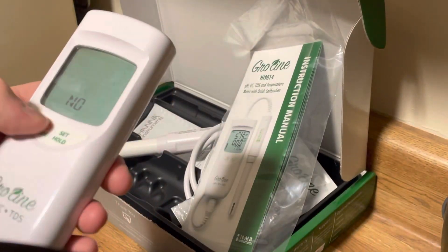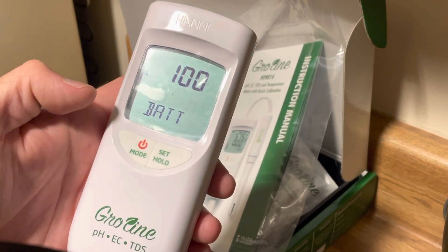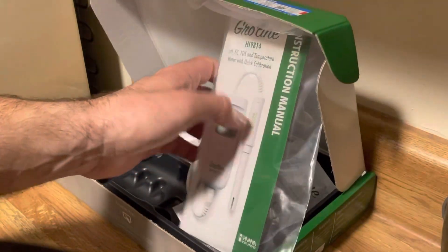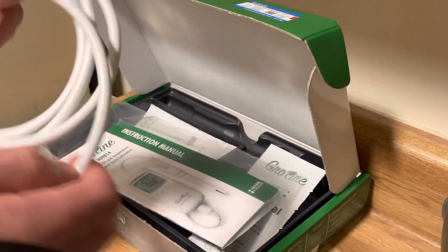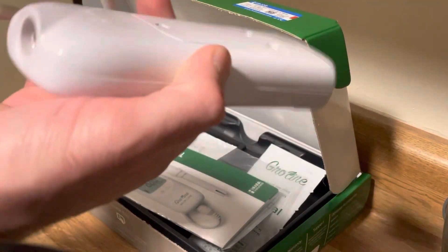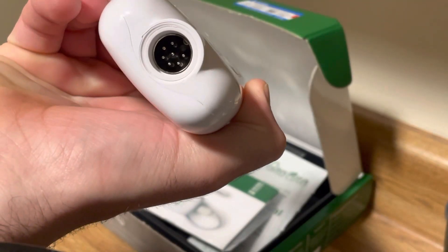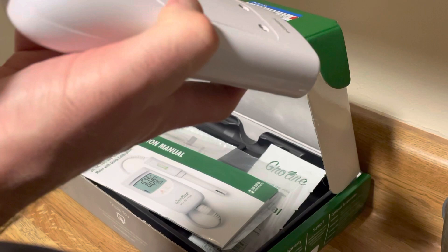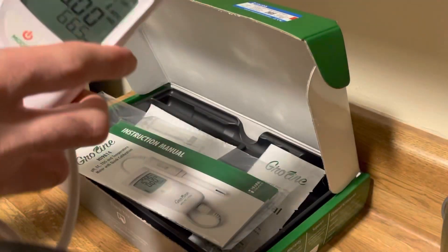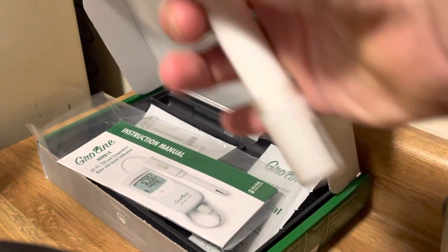Let's turn it on and see what it does — 100% battery. It says 'no probe,' so the probe is that piece right there. You take your probe, unravel it, take this side and it's going to go right into the bottom. Match it up — there's a groove right in there. See that little groove at the top? Match that up, put this in. Now the probe is active.